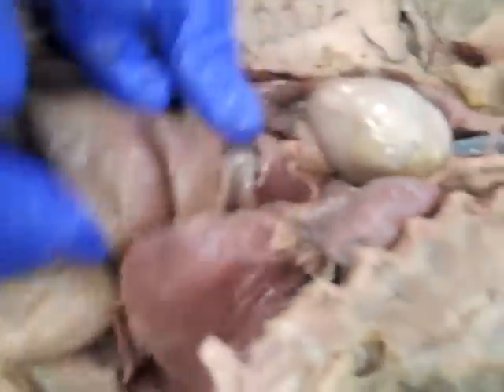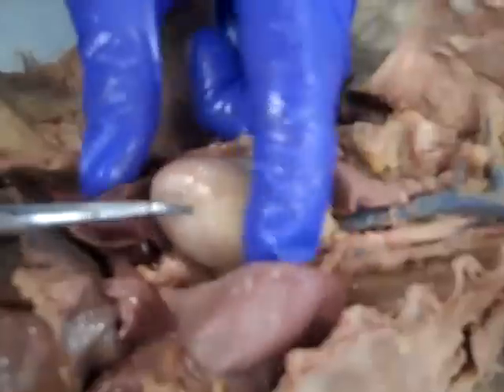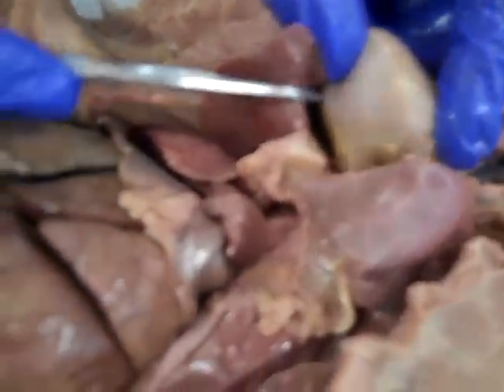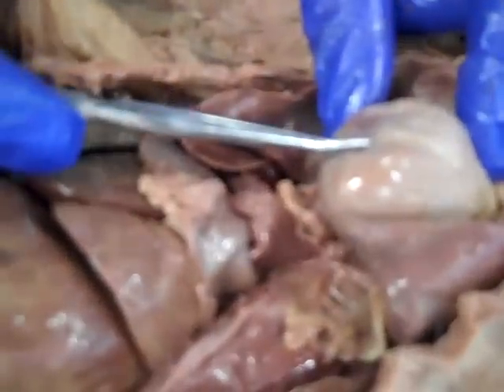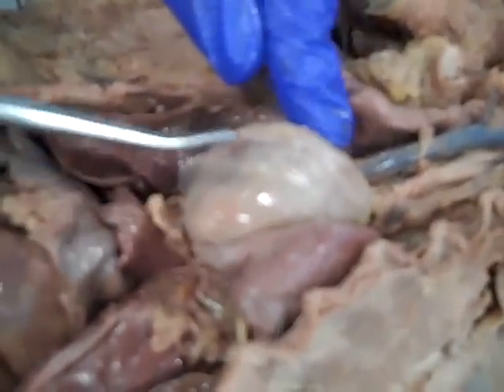All right, what else? I think that's it for arteries. Do we see any coronary arteries in the wall of the heart? Sometimes they take the dye, sometimes they're too small. Too small. So we'll come back and we'll do veins next time.